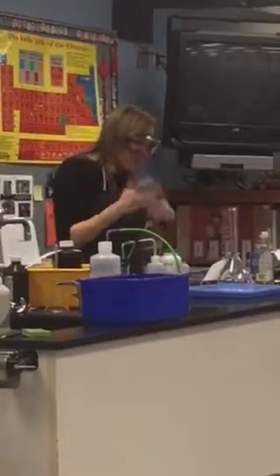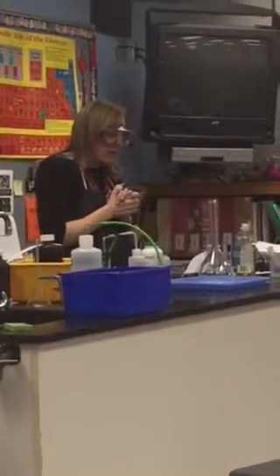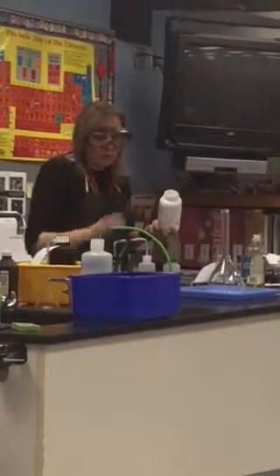Now, we have some options here. This is all about factors that make reaction faster. This is the perfect demo for it because we're incorporating concentration, 3% versus 30%. So we're upping the concentration. I'm going to add a catalyst, which is supposed to make the reaction go faster. So I'm going to dump some of this KI in here.